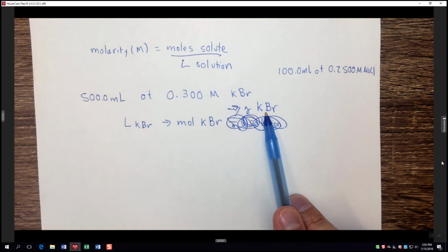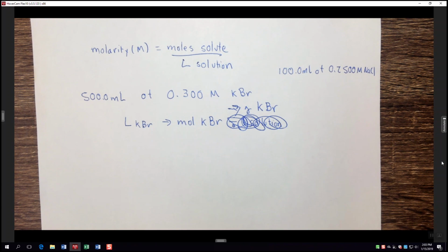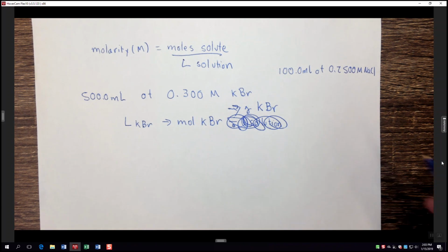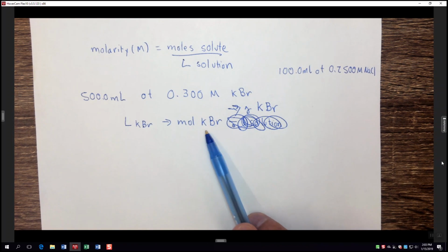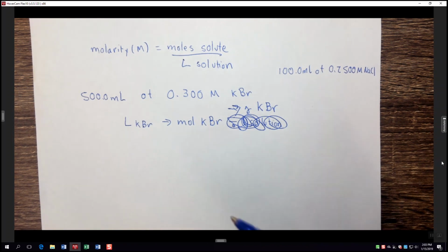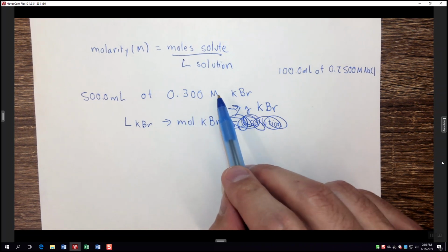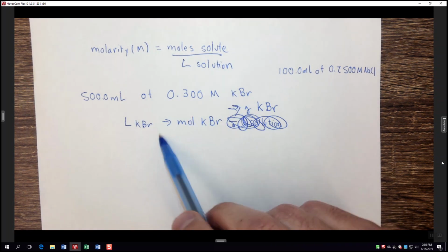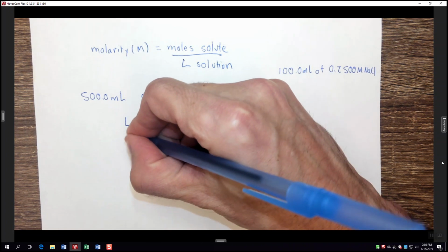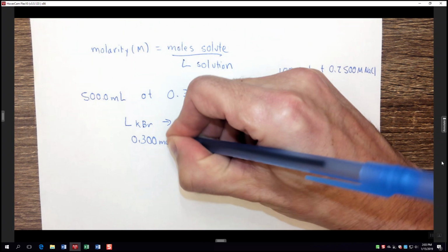I'm not going to go over that example, but in a minute I'm going to go over a similar example, where we're making a potassium bromide solution. You're then going to dilute your stock solution, in your case the 0.25 molar NaCl, to make a 0.016, a 0.012, a 0.008, a 0.004, and a 0.002 solution. So you're going to make 5 lower concentration solutions as described in the lab manual. In this case, we're just going to go over one example where we dilute our KBr solution. So what I want to do now is switch to the camera view so I can write.